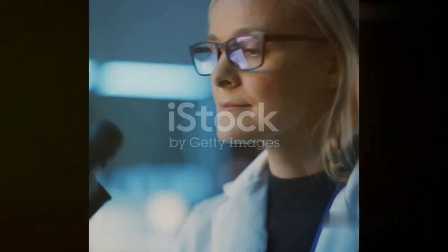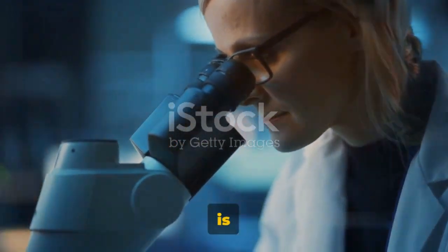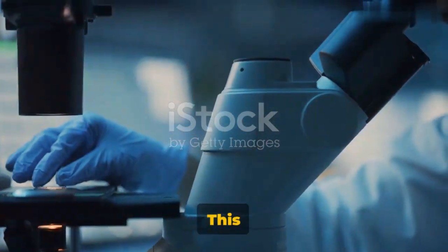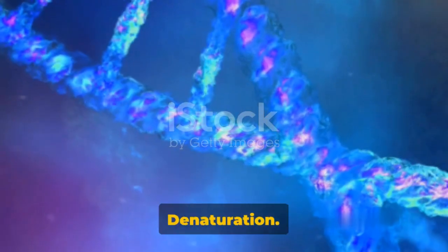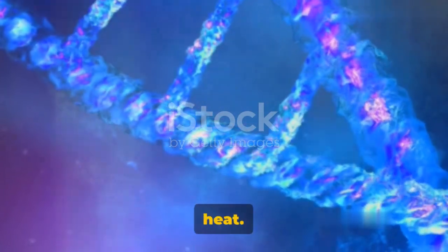Let's dive in. The first major step in real-time PCR is amplification. This is where we take our double-stranded DNA and prepare it for replication. This process can be broken down into 3 stages: denaturation, annealing, and extension. We start with denaturation. Picture a tightly wound rope. To untangle it, we need to apply heat.